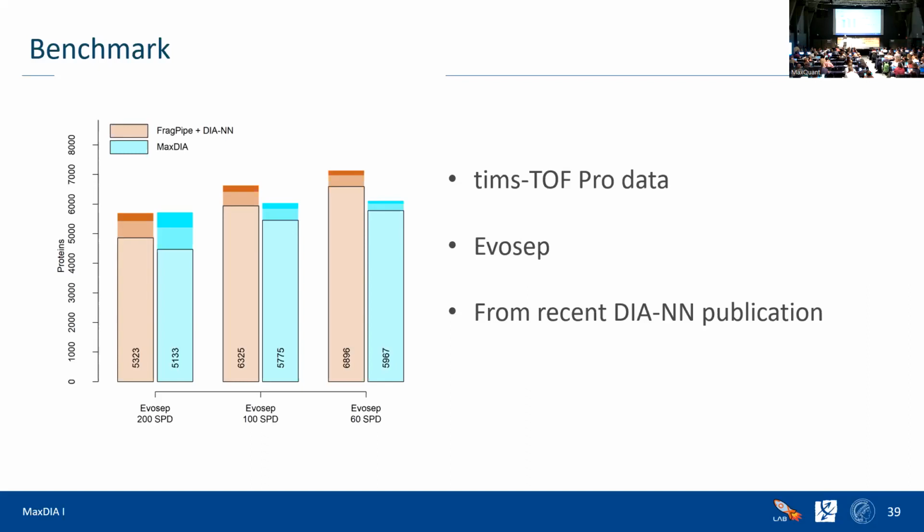Is it possible to combine libraries? Let's say that you've got a human cell infected with a pathogen, and you can generate the two libraries independently, or are you better off training a new discovery library based on some initial data using the two different genomes? No, you can combine libraries. You just put multiple lines in the field where you are supposed to enter the library. You can also make them sample specific.